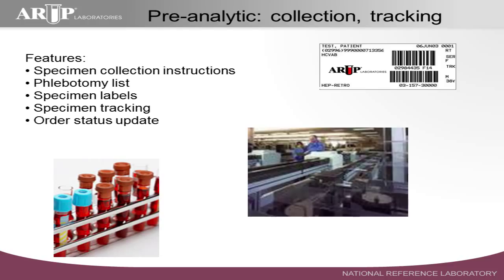And of course, once we start receiving those specimens into the laboratory, the status of the order has to be changed so we know what's going on with that particular order and the specimens associated with it.